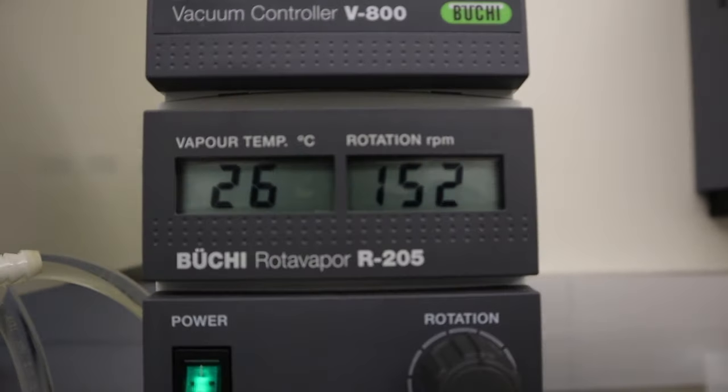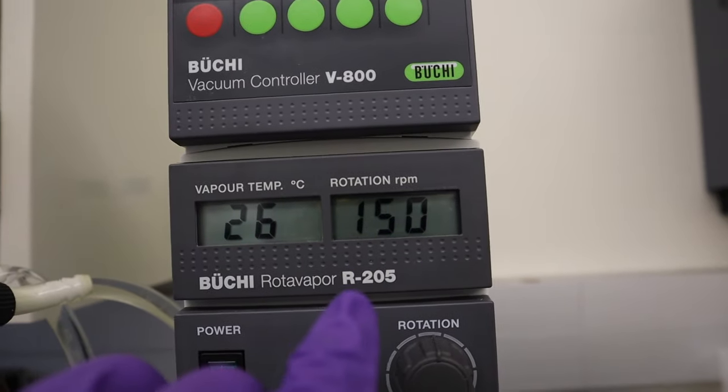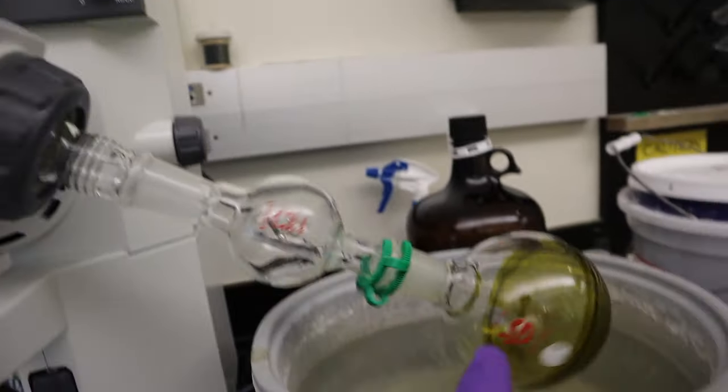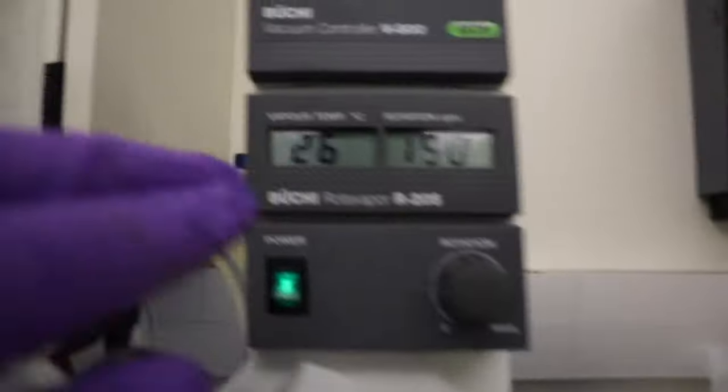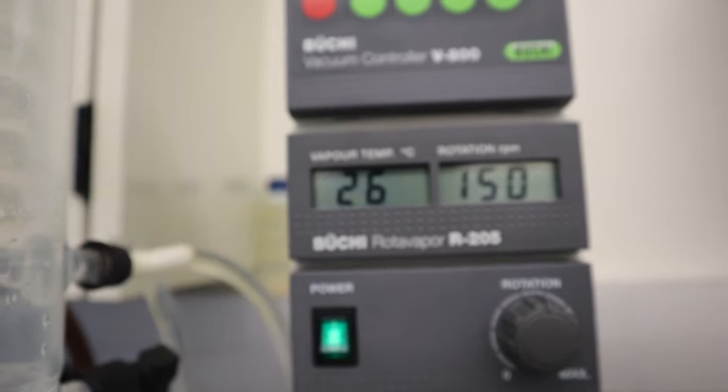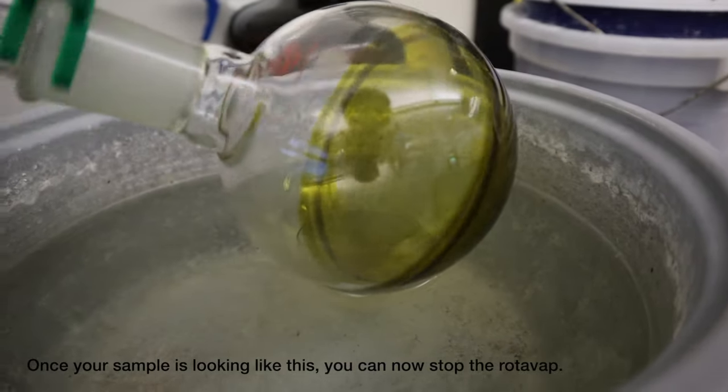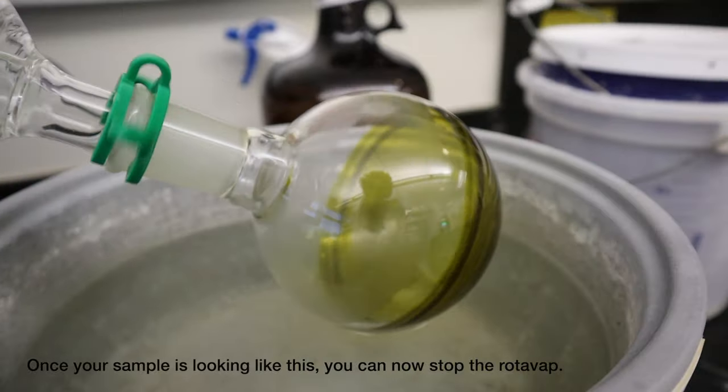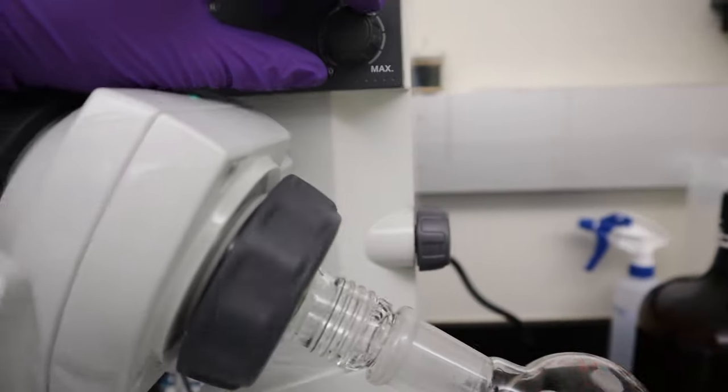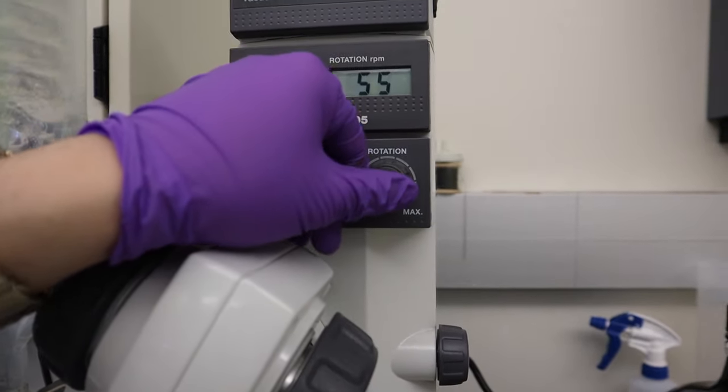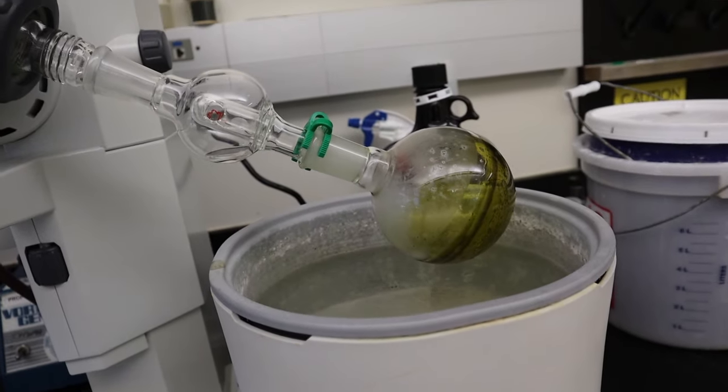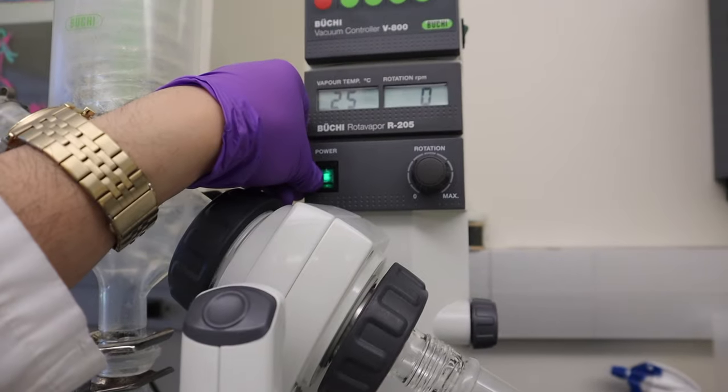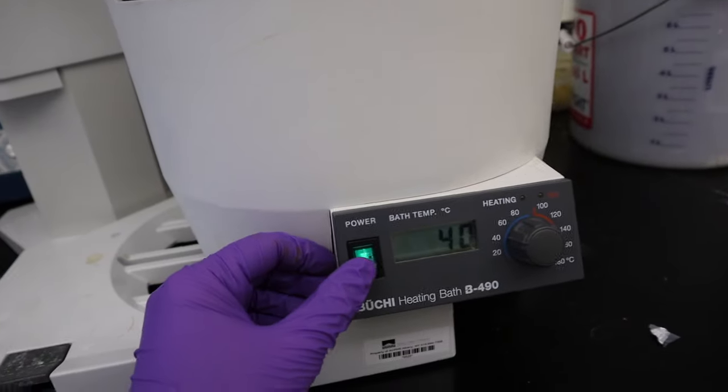In this machine, you can see the RPM or the rotation per minute of this round flask. Once it is already looking like this, you can now stop the rotary evaporator. Stop the rotation, raise the flask, and turn off the heating bath.